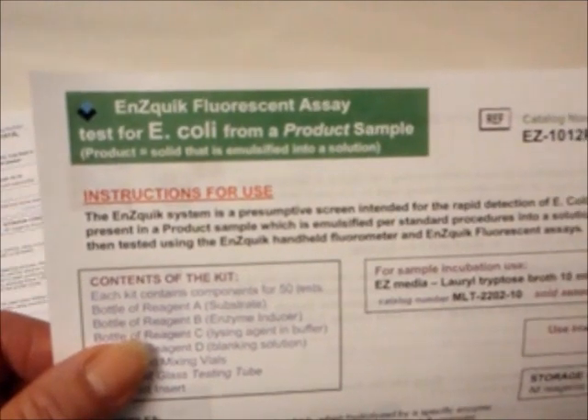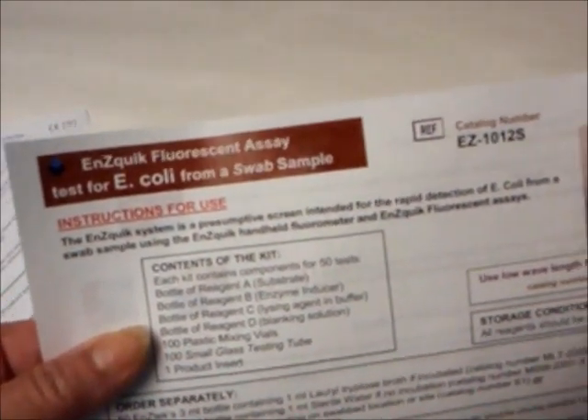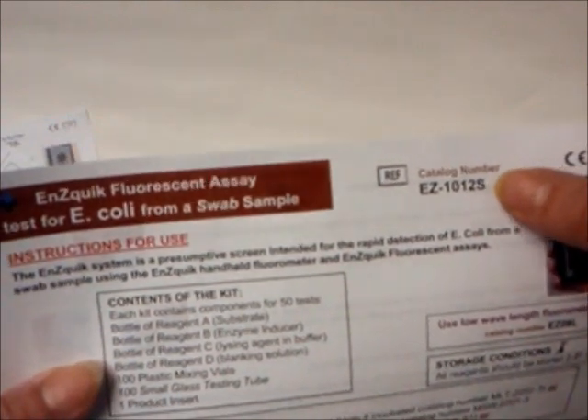If you are testing samples such as food or cosmetics that need to be emulsified, then you will use the kit that contains the letter P for product. If you are collecting a sample that requires a swab for collection, such as when testing surfaces, then you will need to follow the product insert which contains an S for swab.